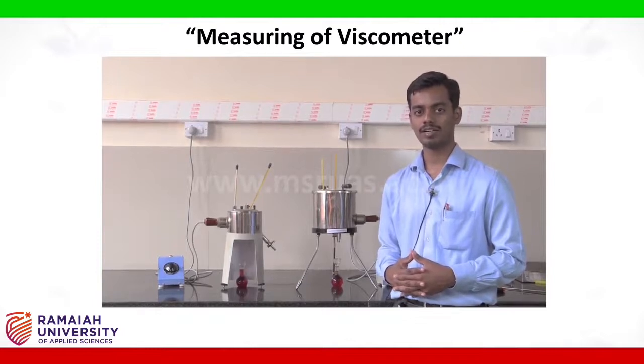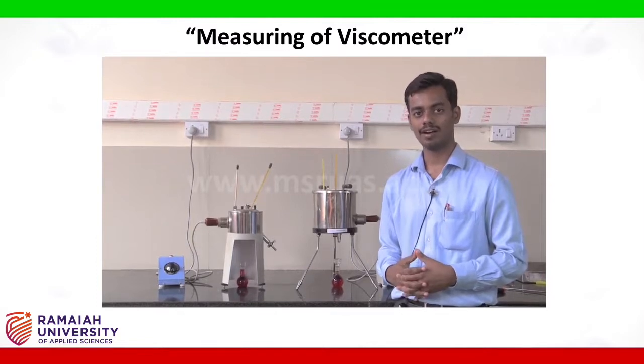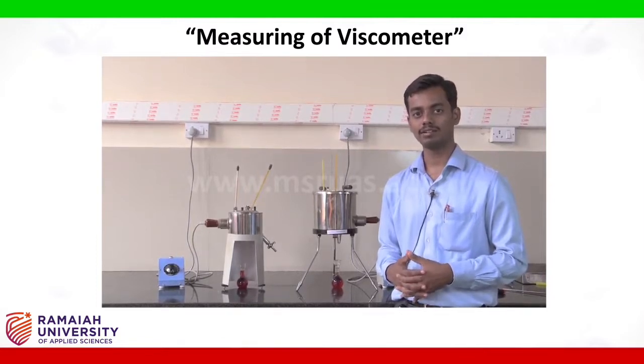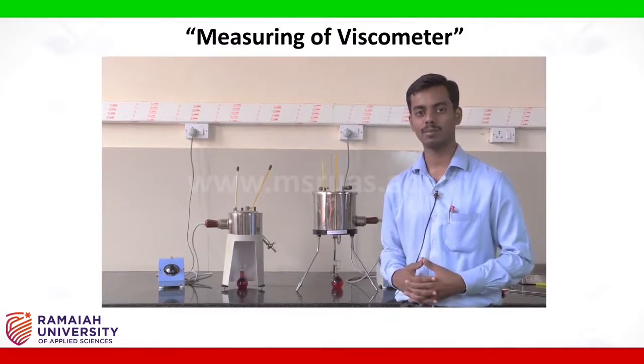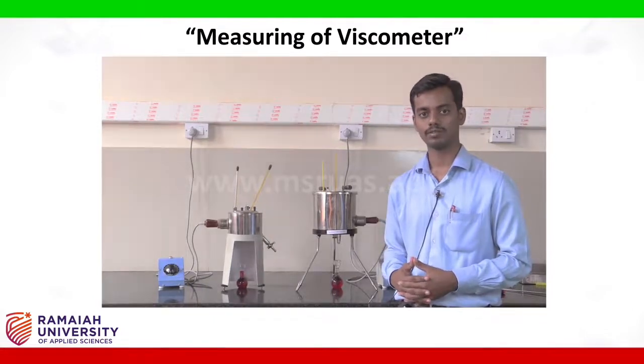Now once the time and the weight are noted down, we can calculate the kinematic and the dynamic viscosity of the oils at the respective temperatures. And that shall conclude the experiment.